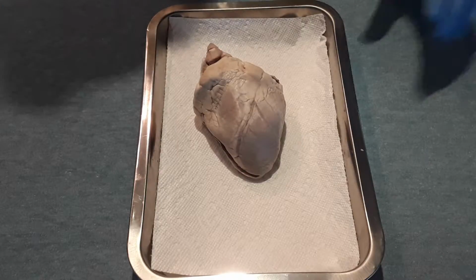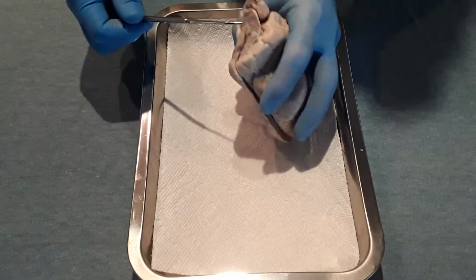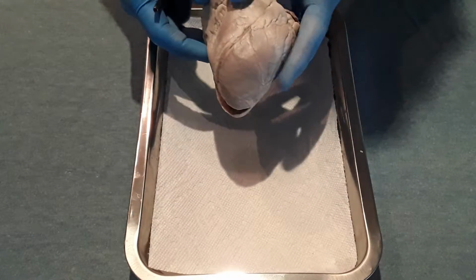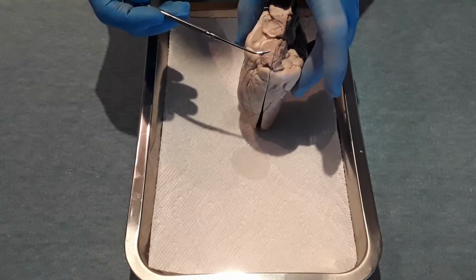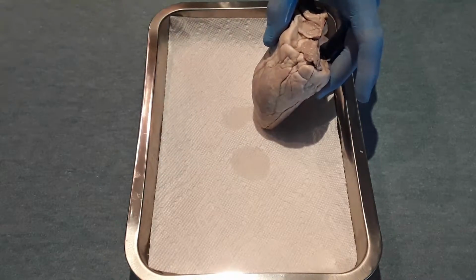A couple of other things to look at here are the right auricle, this kind of darker area here. It's a little sac that sits on top of the right atrium, which is right under this fatty layer here, the very top of the heart. This is the left auricle, and again it is over the left atrium, which you can't see from the outside, but it's right under this fatty tissue of the heart.